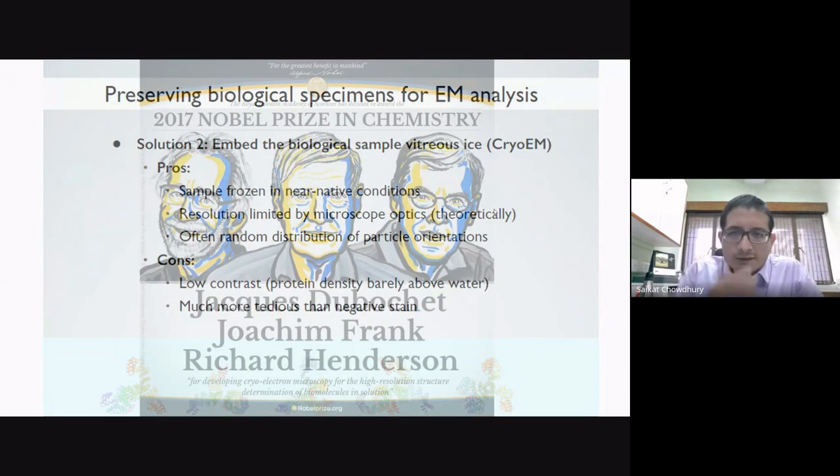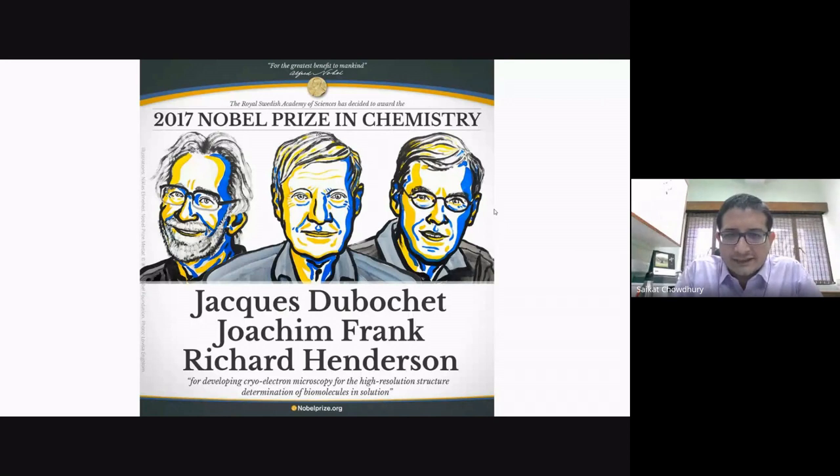Okay, so in 2017, like about 6 years back, the Nobel Prize for recent cryo-EM was actually awarded to 3 people. Jacques Dubochet, who developed this methodology of doing rapid vitrification and maintaining the ultrastructure of biological samples in the vacuum of an electron microscope.